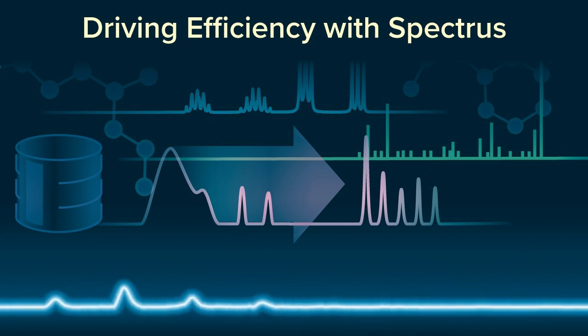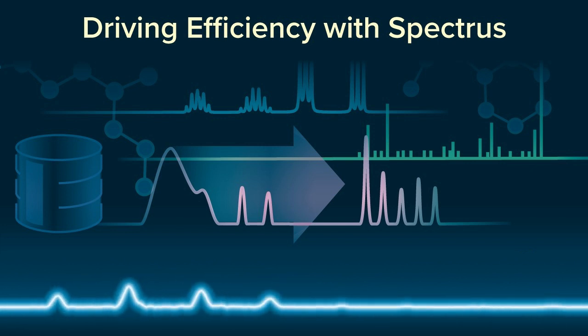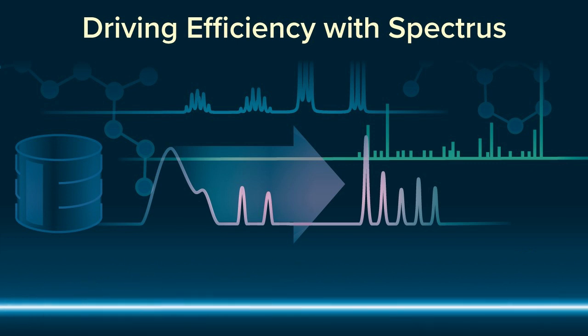After Matt's presentation, we had Kaylee Mercer from GSK. She has been working in the high throughput experimentation group for a number of years, focusing on using automation and robotics to optimize and miniaturize reactions. For those who don't know, HTE is an approach to chemistry where you are running many experiments at once. This is great for accelerating your research. For example, Kaylee is using HTE to optimize experimental conditions, sometimes running over 1,500 experiments on a single plate.